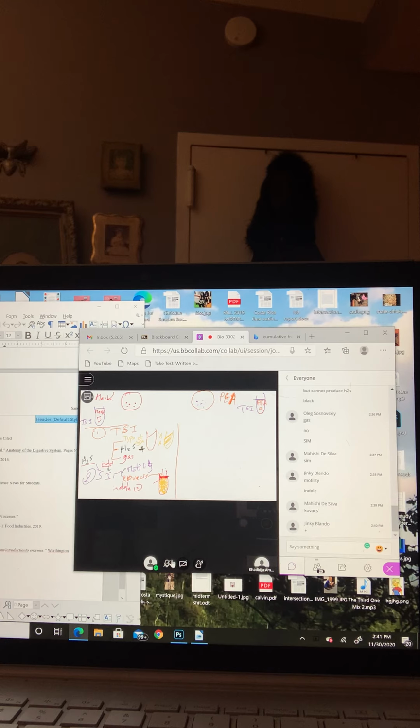Your microorganism is motile. Good. It swims away from the line of inoculation, so you get a turbid tube. Or if the turbidity is restricted to the line of inoculation, it is non-motile.